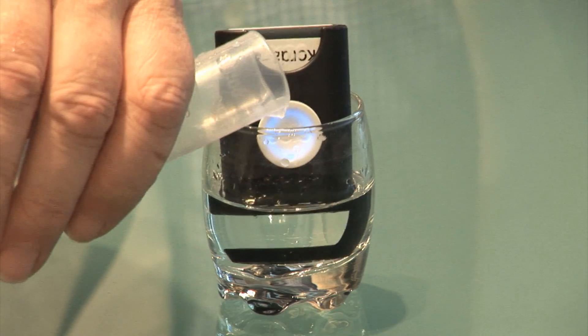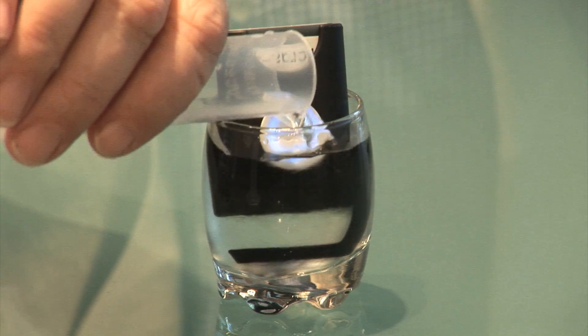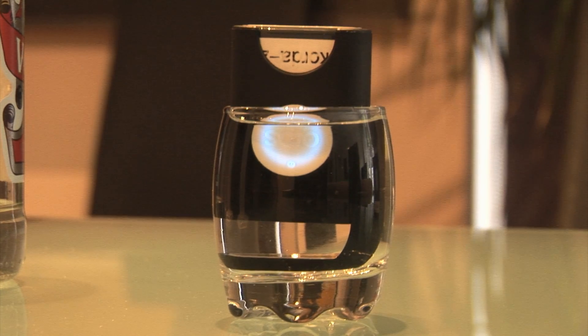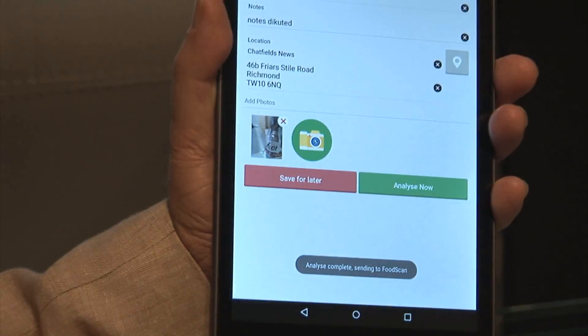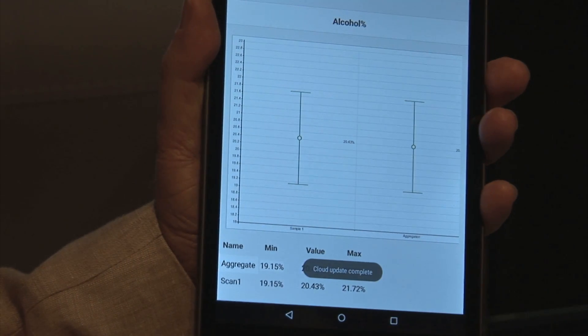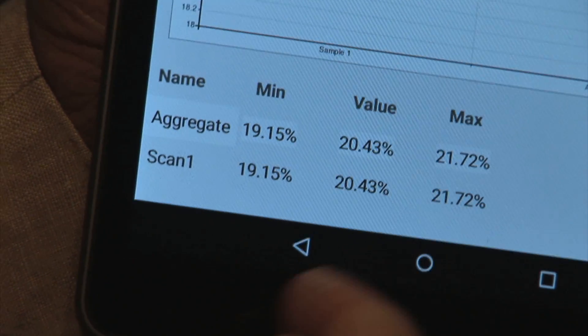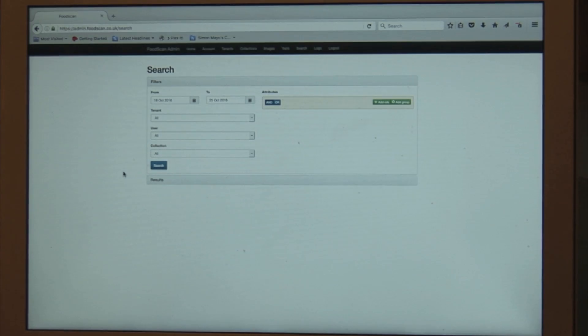Now then, let's add the water to the glass and run the test again. If it all goes well it should be approximately 50% of the previous value. When the analysis is complete you can see that it's between 19.15 and 21.72%.